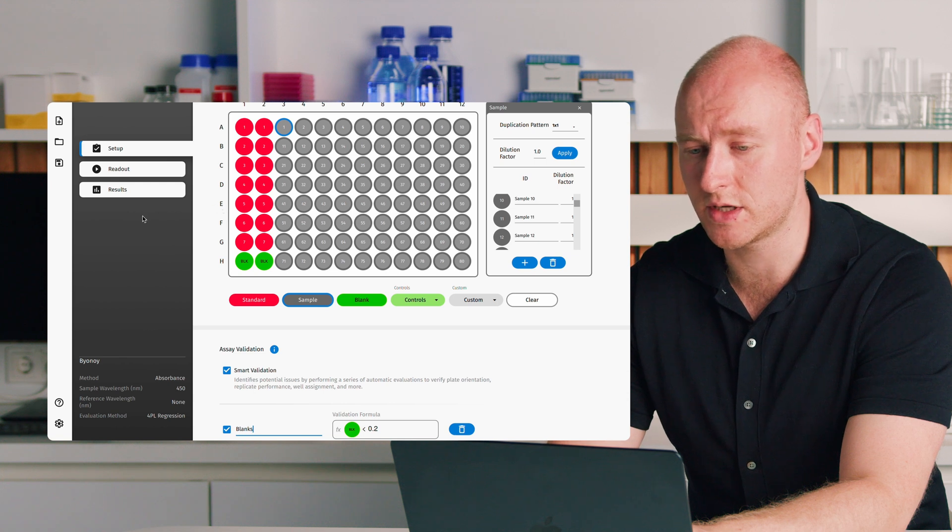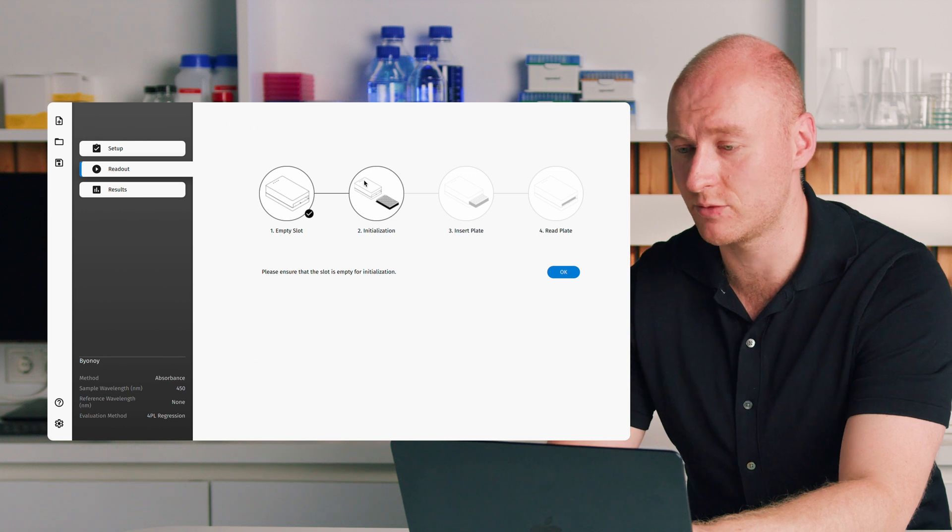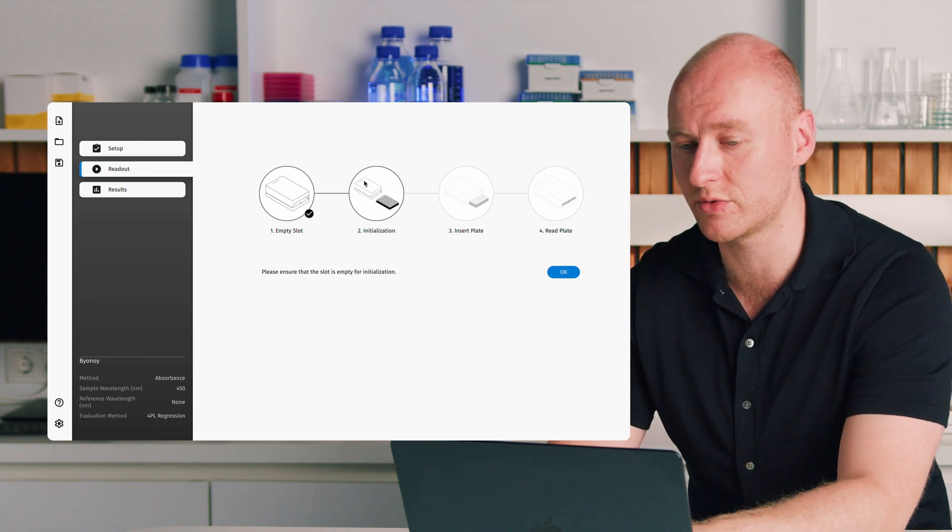Once we've defined our plate layout and assay parameters, we go to readout in the assay control bar and are led step-by-step through the readout process. First we perform an initialization — essentially a reference measurement used to set the zero point of the device, similar to zeroing a spectrophotometer, but performed across all 96 individual detection units.